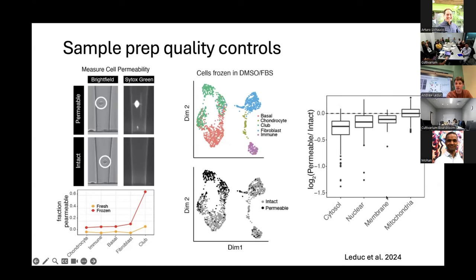These annotations aren't totally perfect, but you'll notice that the mitochondria is not very different. And for those of you who have looked at some RNA-seq analysis, the percent mitochondrial filter is pretty ubiquitously applied in these analyses to filter out cells. It's the same concept: the mitochondria are tied in very tightly inside the cells, so they aren't the first things to go when the membrane ruptures and you still have a cell husk there. Or even maybe a cell husk that's only leaked a little bit. There's some variance in how much different cell types and proteins leak, but generally the signatures were pretty consistent.